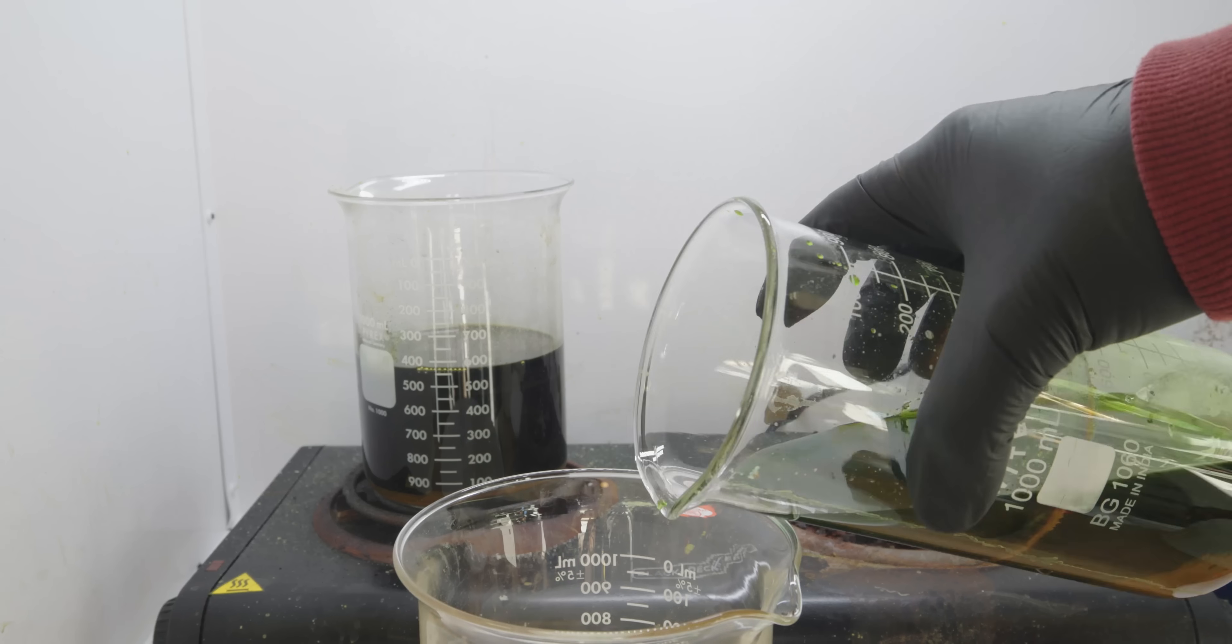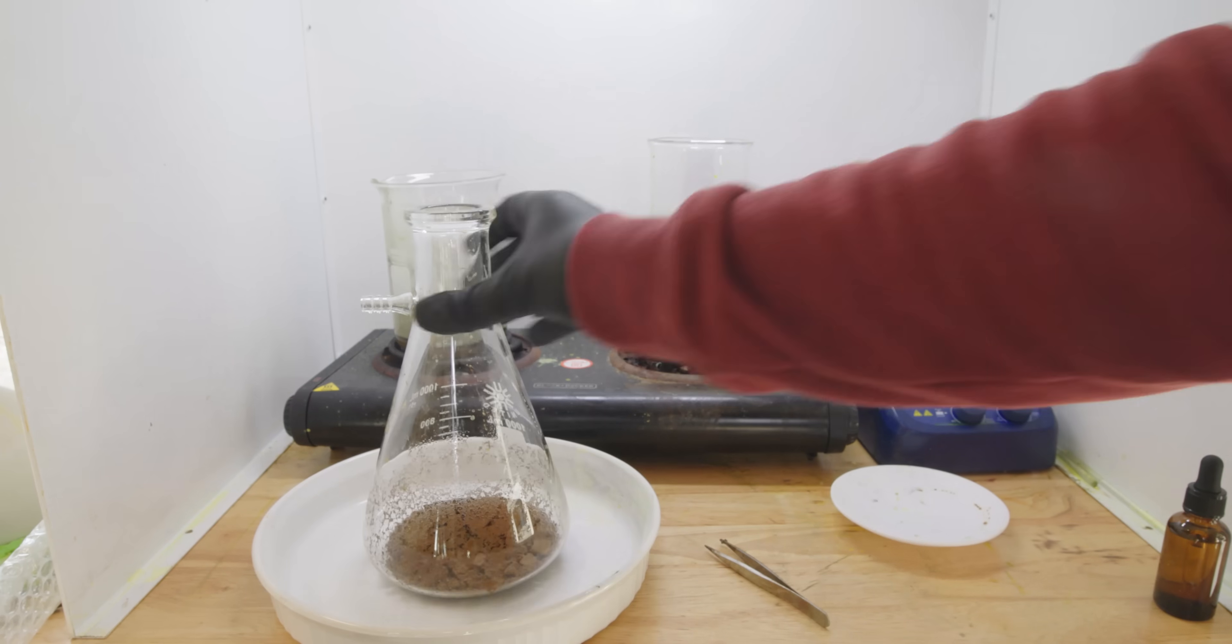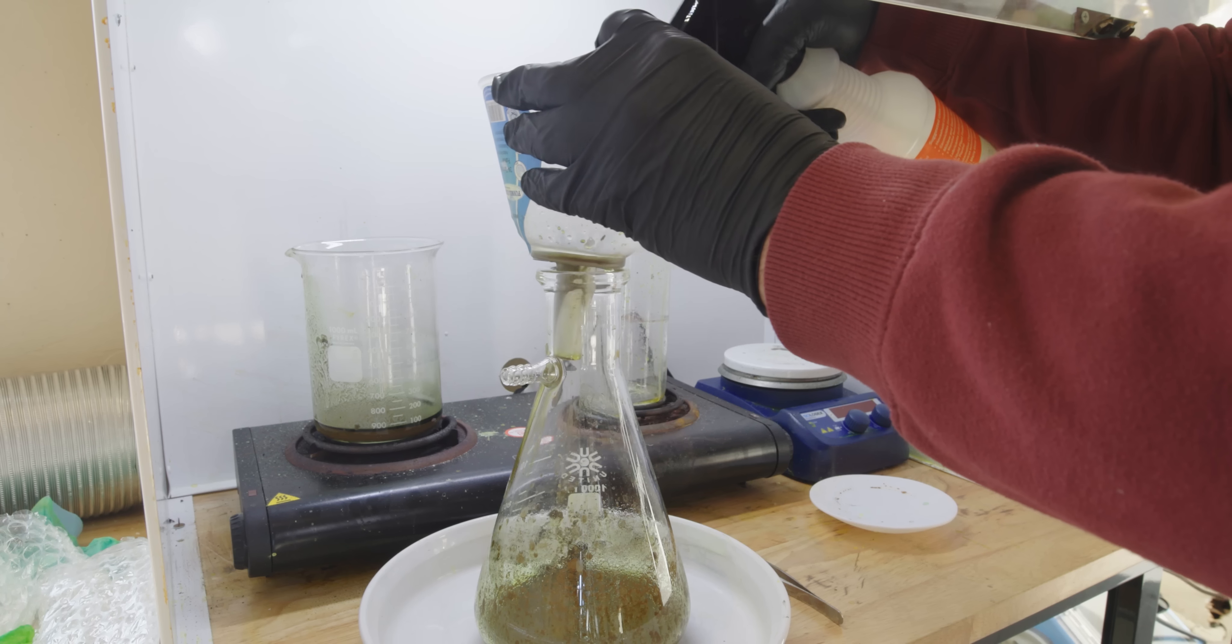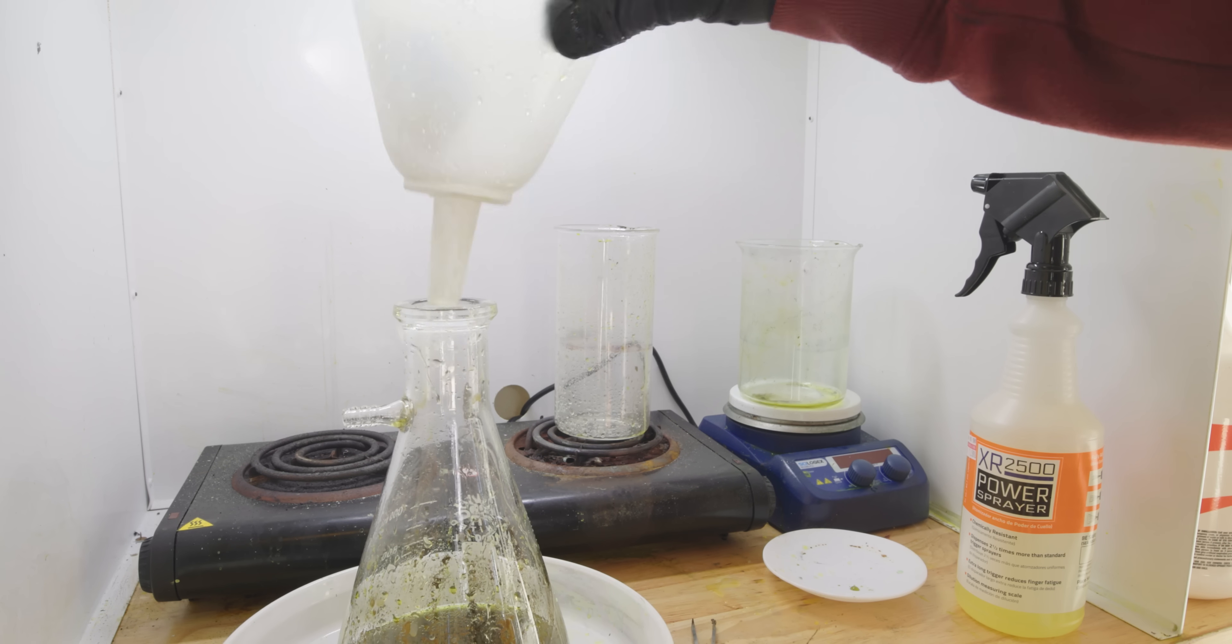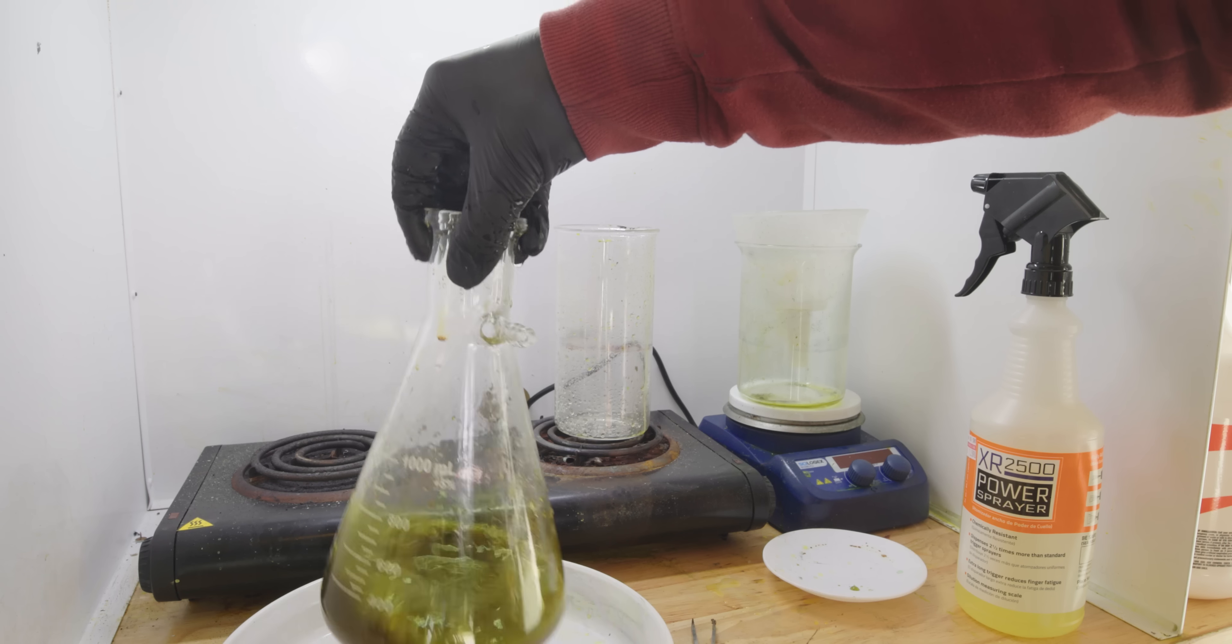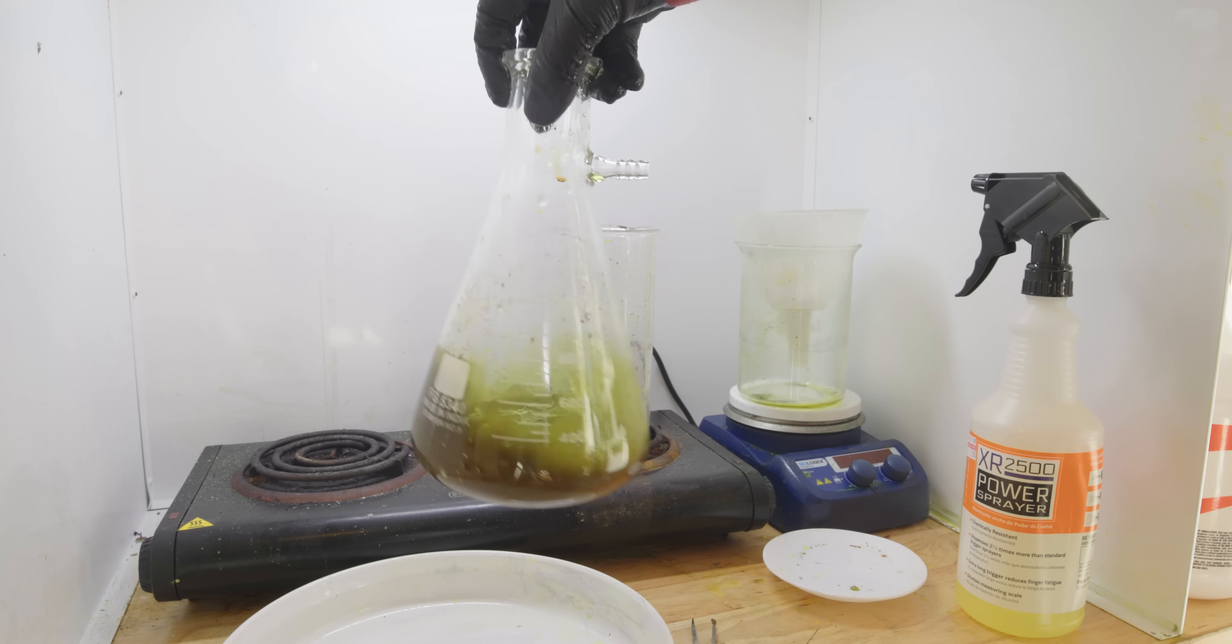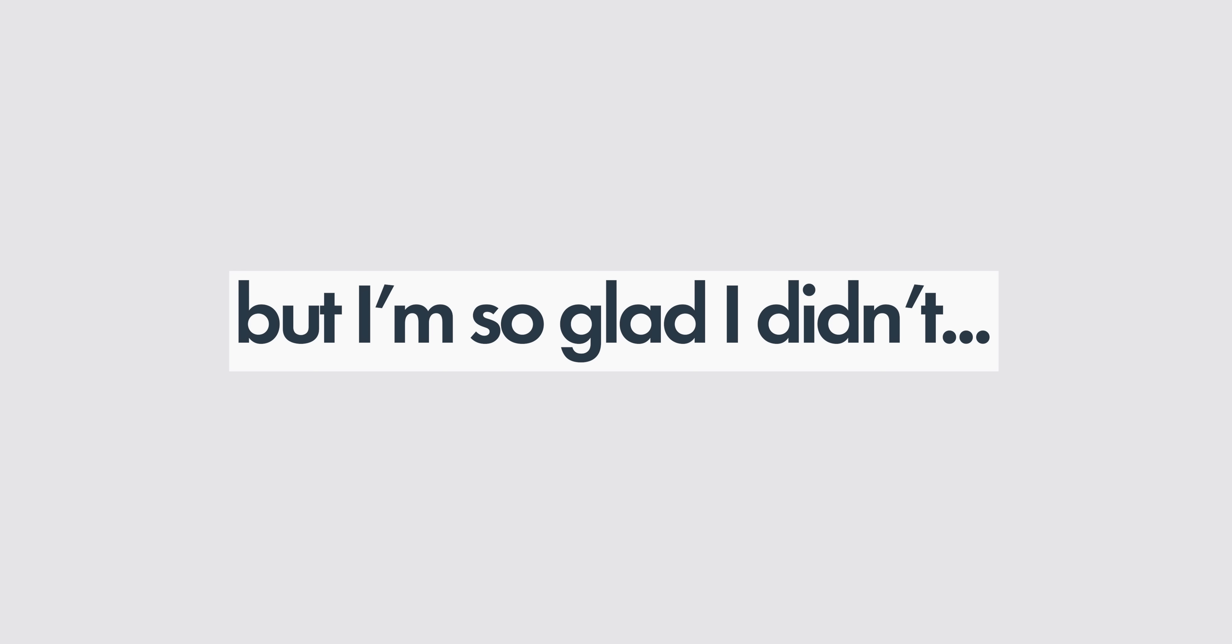I decided to combine all the gold mud into one place, which was really refreshing honestly after dealing with so many different beakers. I used a spray bottle just to make sure I was getting all the last remnants. I was really happy to get to this point in the project. I had sunk so many hours into it and already felt like I was almost done. But my research told me otherwise. You see, in order to achieve a higher purity, I needed to repeat the entire process. I really wanted to quit, but I'm so glad I didn't.